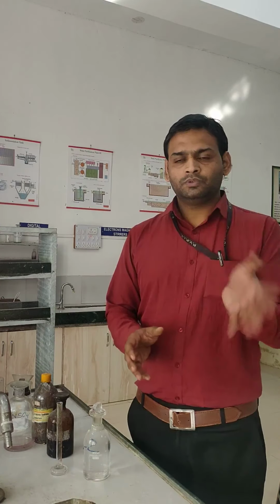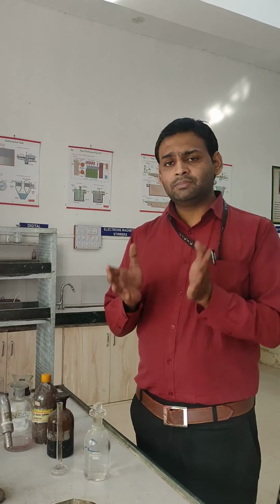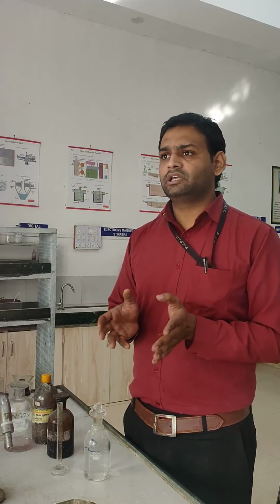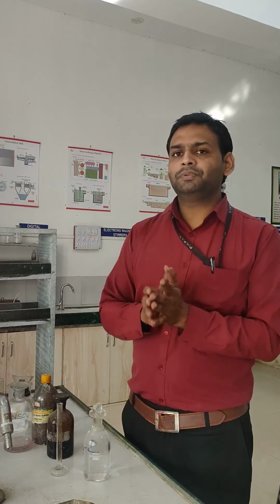Okay, so now, what is the principle? The maximum amount of saturated oxygen present in water at 0 degree Celsius is 14.2 mg per liter. At natural or normal conditions, the amount of oxygen varies with the temperature.